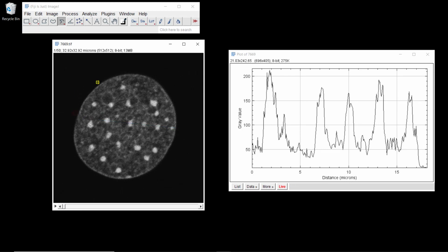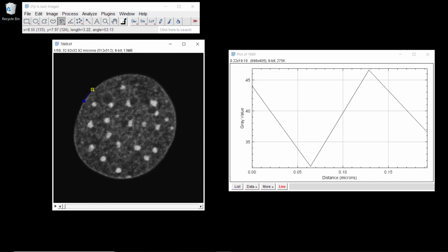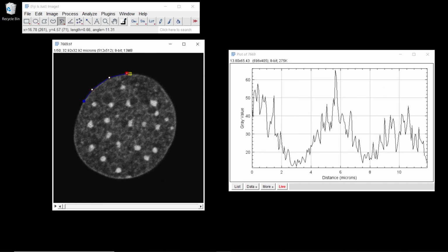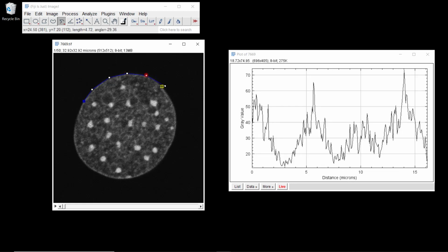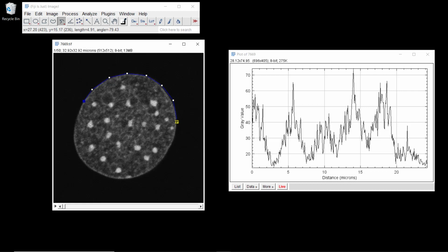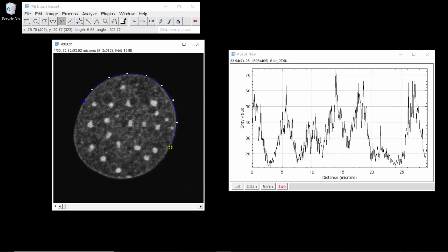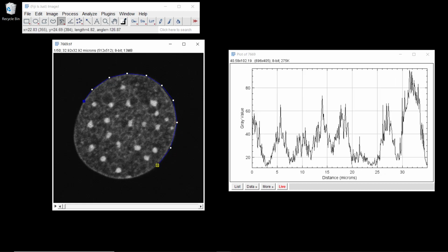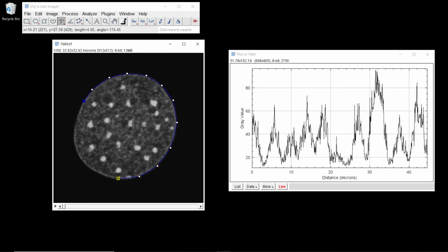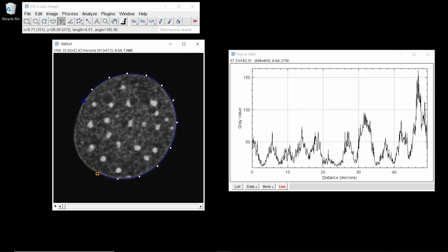Okay, so I left click, and it removed the row, and now I can set up a new row. And you see in that setting now you just define points that are part of the line. And it's funny with the live, you see that at each point you add, you actually modify your histogram.